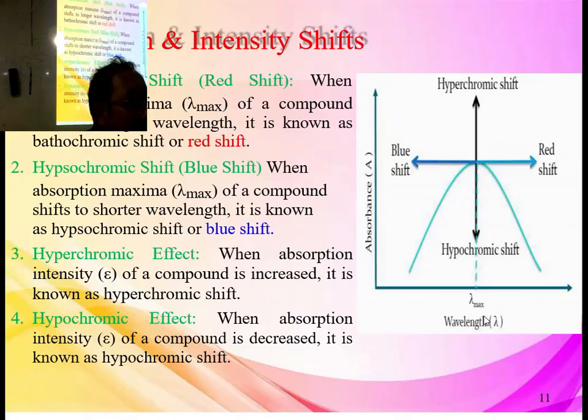Suppose the absorption started from a region 400, and up to 200 you have scanned and found that in this range, 400 to 200, you have got one peak. But at which position do you have the best, highest peak? Maybe it is 197.42. The 0.42 you can ignore actually. That comes because when you make a plot and find out from the plot, some fraction may come out, but that is meaningless. Wavelength cannot be broken, so we will take the round value.